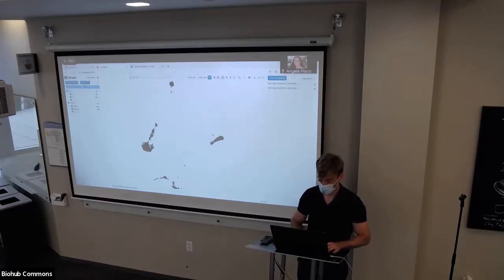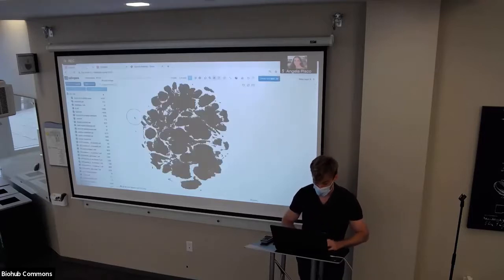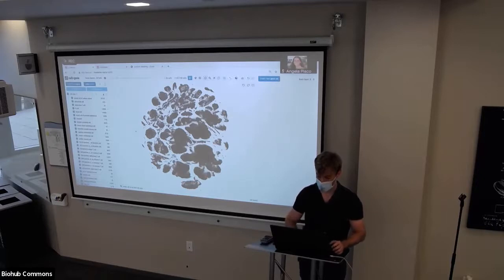You select one, and then you do Shift I. What it does is it automatically sets the one you've selected to cell set 1, and then it sets the inverse to cell set 2. This is really useful specifically for marker gene identification. For example, I want to do marker gene identification for this cluster, and maybe I don't have an annotation for it, and it's a lot of point and clicks to generate a categorical for the sole purpose of selecting just that cluster. So what you do is you select this thing and then just hit Shift I. Now you have 20 cells in cell set 1, and the remaining cells in cell set 2.